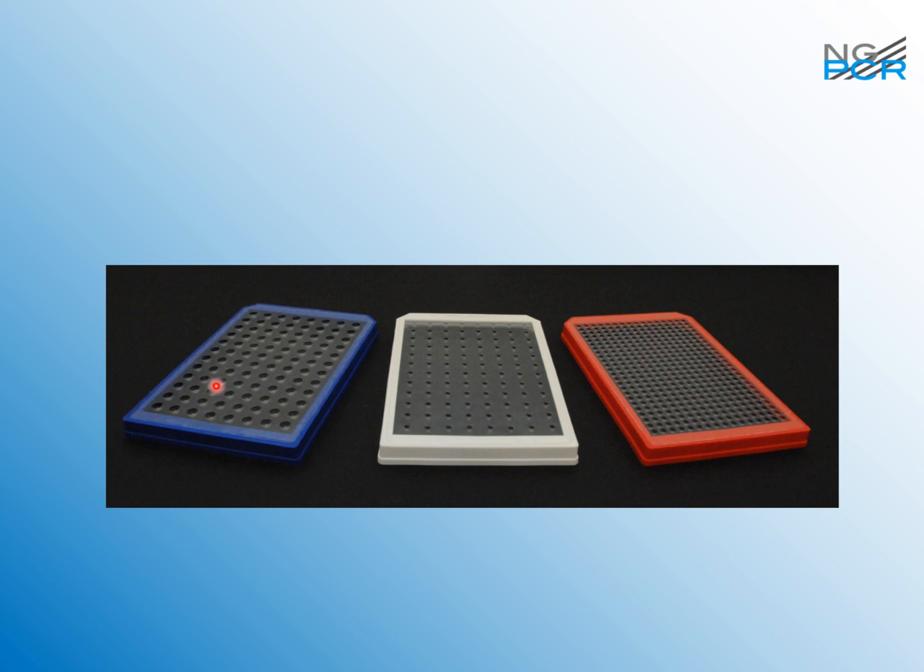On the left here, the blue one, you can see a plate with 96 wells, which holds between 5 and 20 microliters. On the right, this is what you are used to also now. On the right, you see a 384 well plate. This has 384 wells, which holds between 1 and 5 microliters, maximum 5. This you also know. This you can stick in the same machine without changing anything. It will accept both plates and do a PCR in both plates.